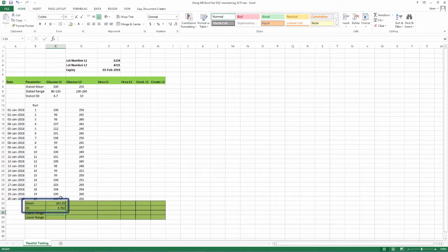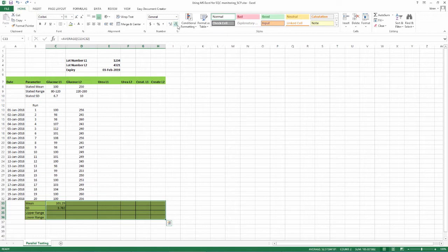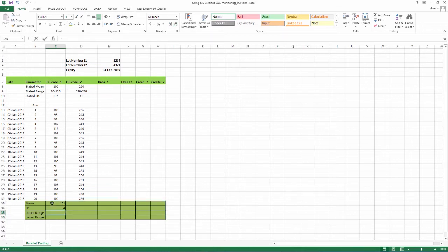So now, you have observed the mean and SD, you can reduce the number of decimal places like this. Select the two calculated numbers, go to decrease decimals on the toolbar. In the case of glucose, as we do not report patient samples in decimals, we can take out the decimals fully.